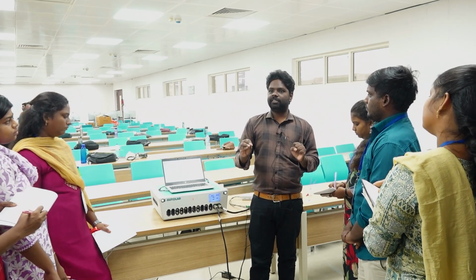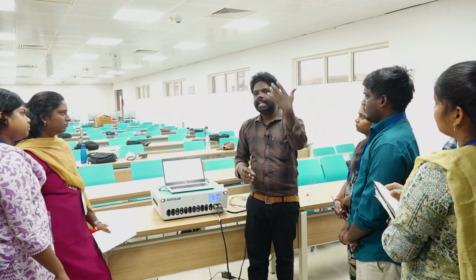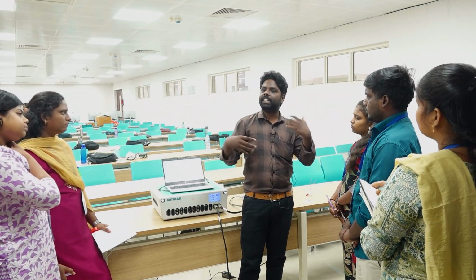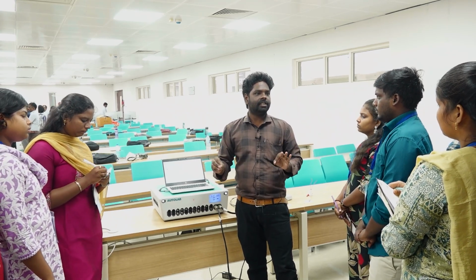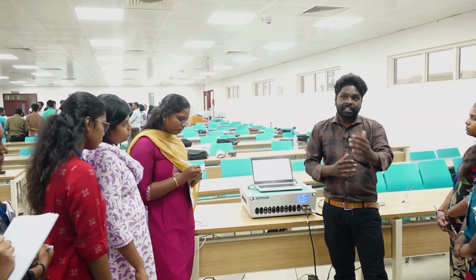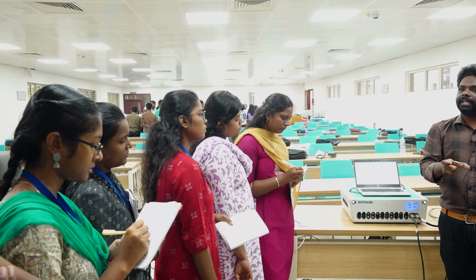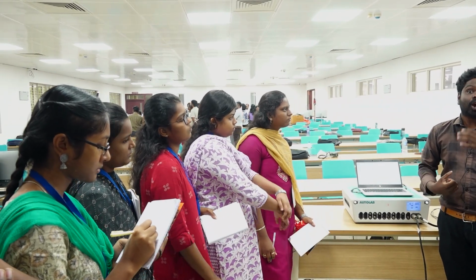In EIS, this is one of the very important techniques. Comparatively, if you take any other technique like CV, LSV, whatever the DC techniques, that is a destructive technique. That means if we are testing our sample, your sample must get destructed. We are applying input, polarizing the material, and your material will get disturbed, but in EIS it won't disturb much. Still we can measure the actual characteristics or properties of the material without destructing the sample.